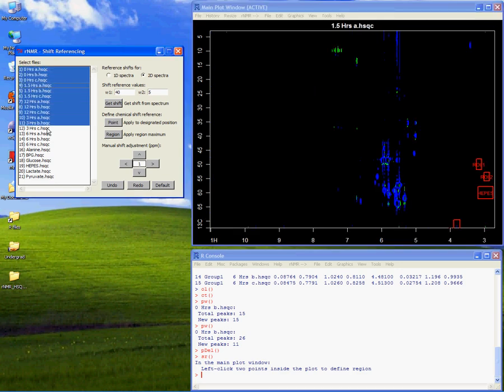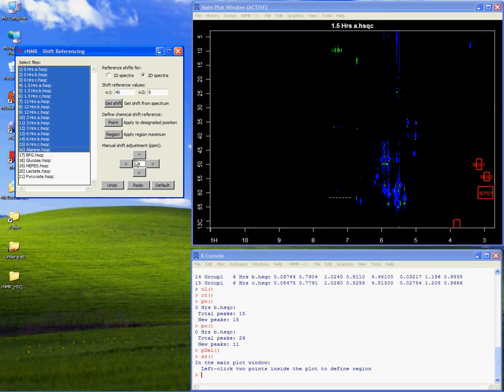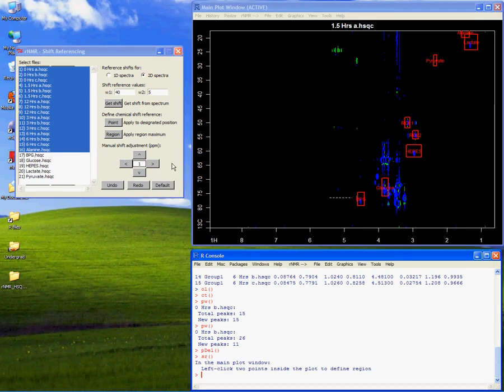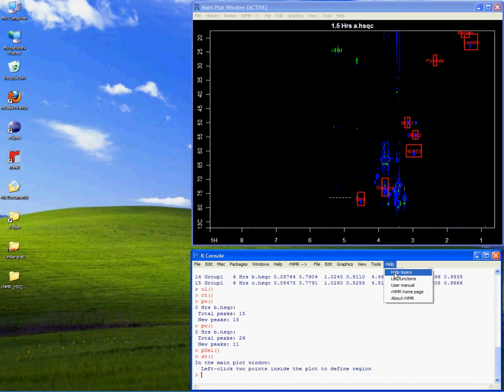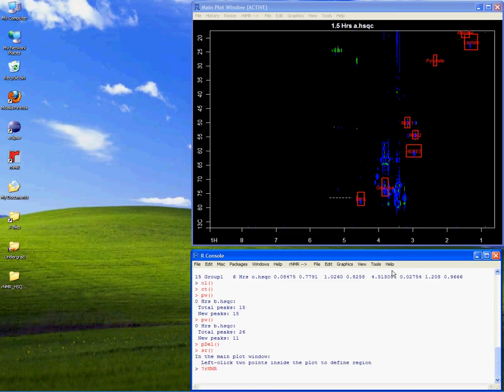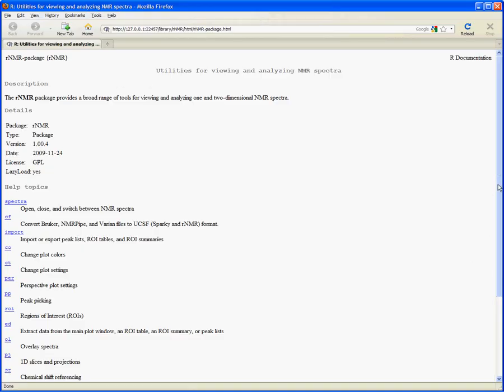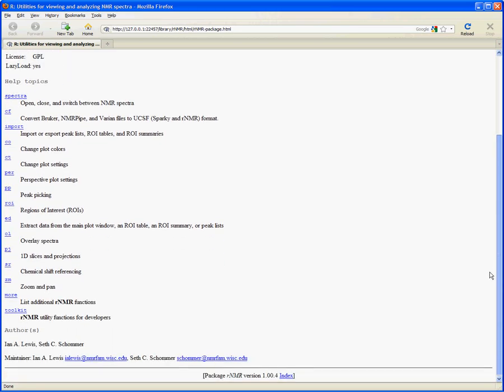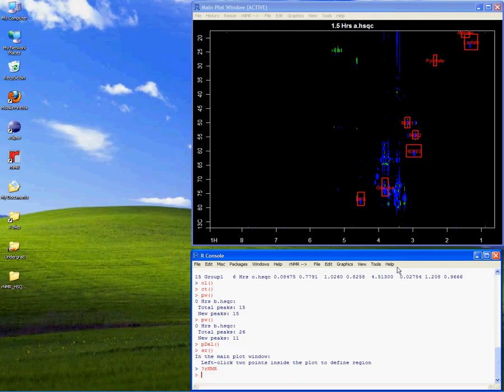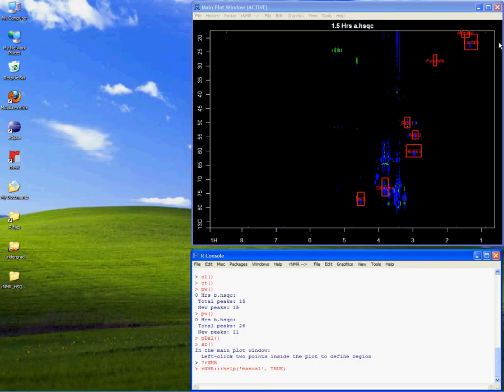Of course, these spectra were already referenced correctly, so I'll select them again and restore them to their original state. To add to RNMR's user-friendly interface, we have also included a comprehensive set of help documentation. Help documents can be accessed by topic, or through the RNMR user manual, which acts as a step-by-step guide.